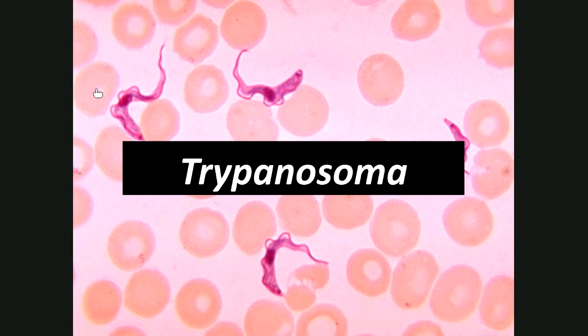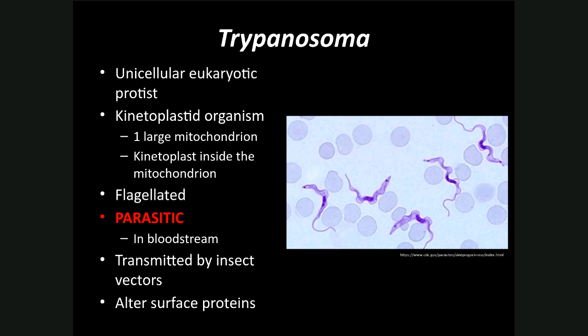Now, this is one of those organisms where when you're looking at it through a microscope or looking at a picture, you have to take a look at the entire picture of what you have. So don't just focus on the organism, look at everything around it, because that is a clue about what kind of organism you're looking at. So I hope that you've already been thinking about that as we go into some more detail.